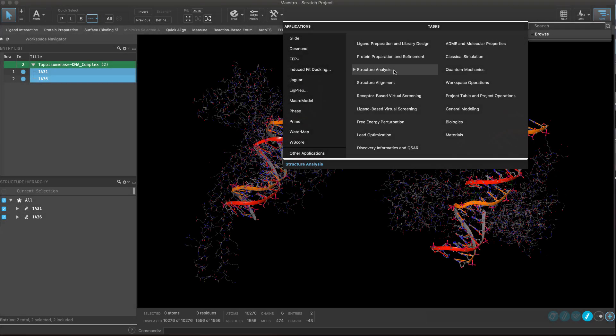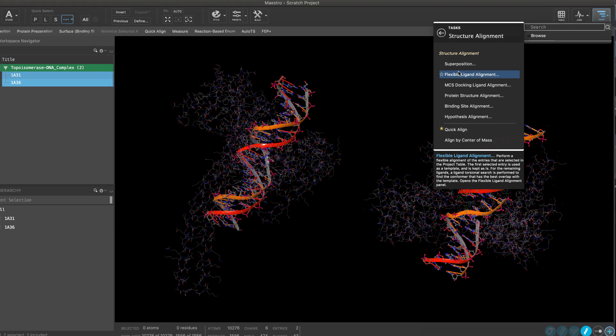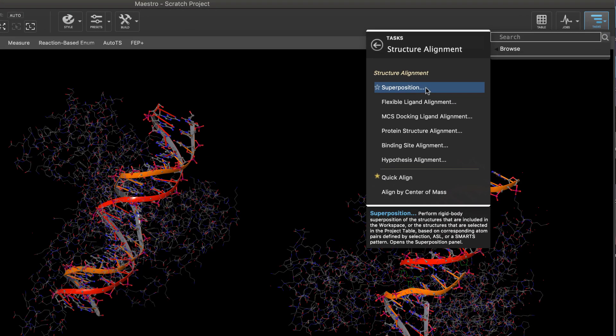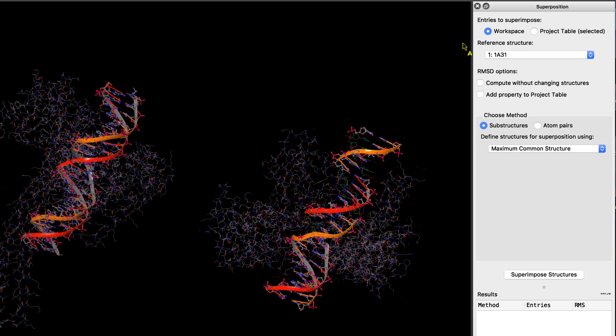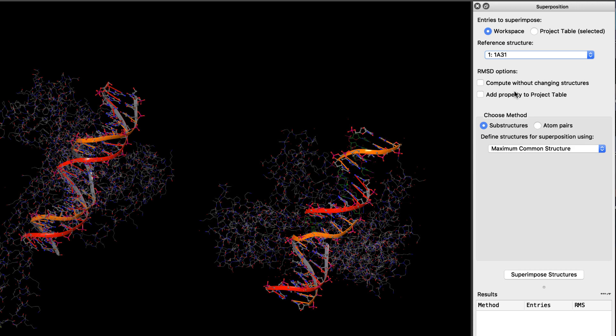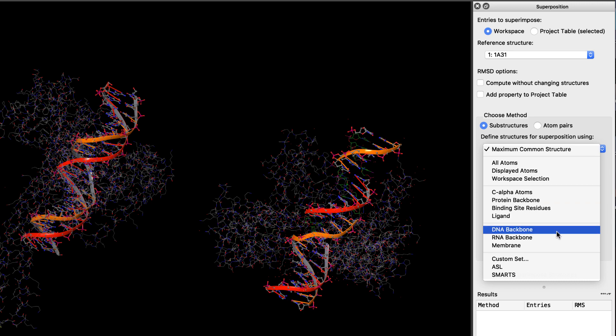Starting in Maestro, we see a new and improved superposition panel. It now has better indication of the reference structure and a greater collection of handy substructures to choose from, including maximum common substructures, binding sites, and DNA-RNA backbone.